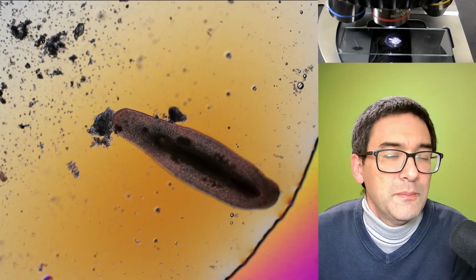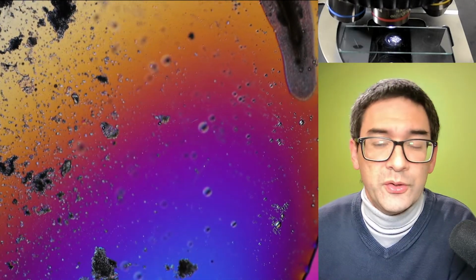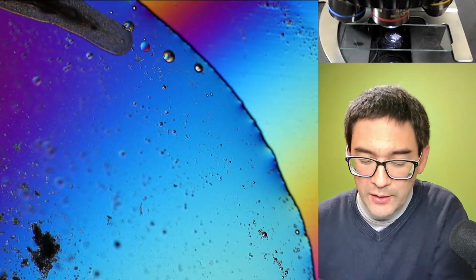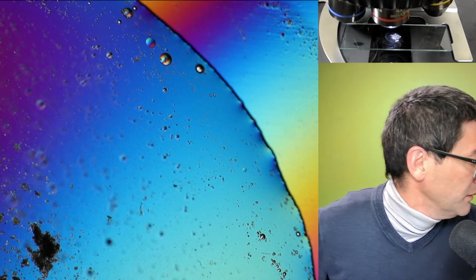So you know what I'm going to do? I'm just going to leave it like this, and I'm going to try it now on other organisms as well. I'm going to leave it here on the side. I just have to make sure that it doesn't dry out. And I'm going to now take another water sample here.